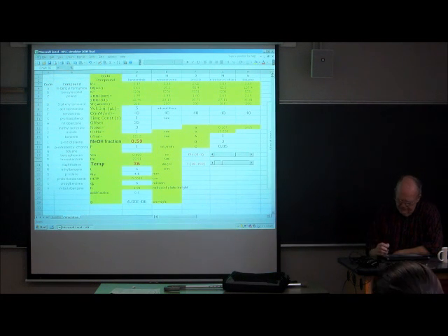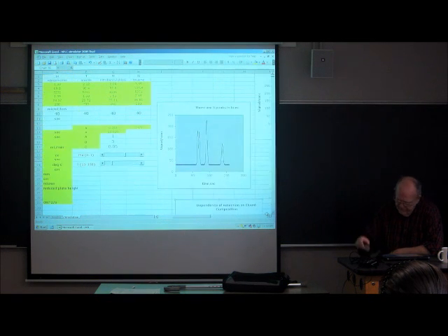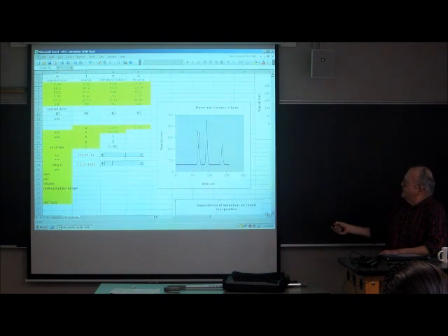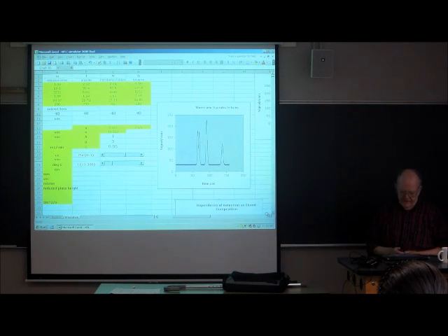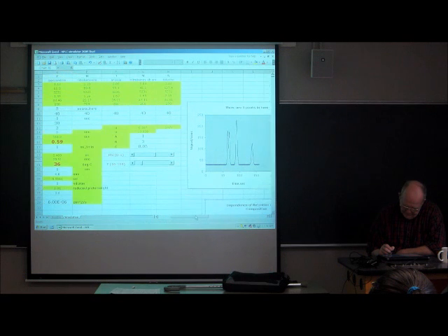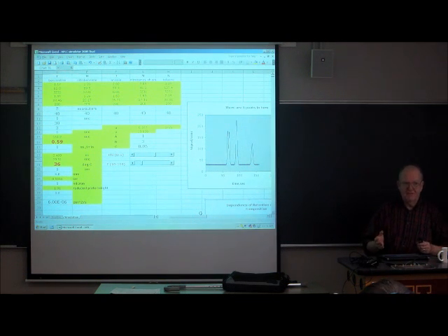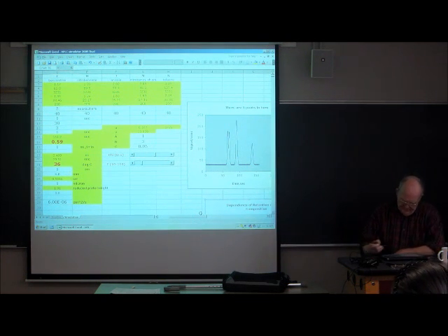The chromatogram assumes that there is some noise, which is why this is a little bit fuzzy, and if you look at the top of the peaks, they're a little bit fuzzy. And the time constant certainly affects that noise. So you may want to play with the time constant to adjust the noise to get best results. Although if you make the time constant too big, you're going to pay a price for that, as we discussed.